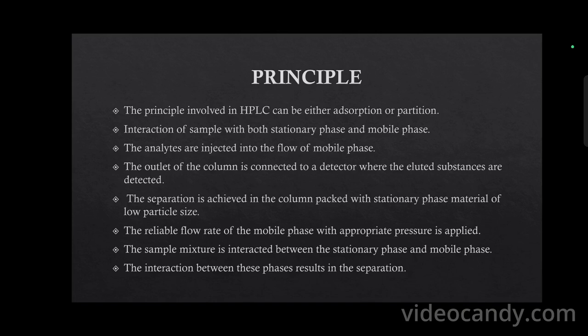A reliable flow rate of the mobile phase with appropriate pressure is applied, and the sample mixture interacts between the stationary phase and mobile phase. The interaction between these phases results in separation.